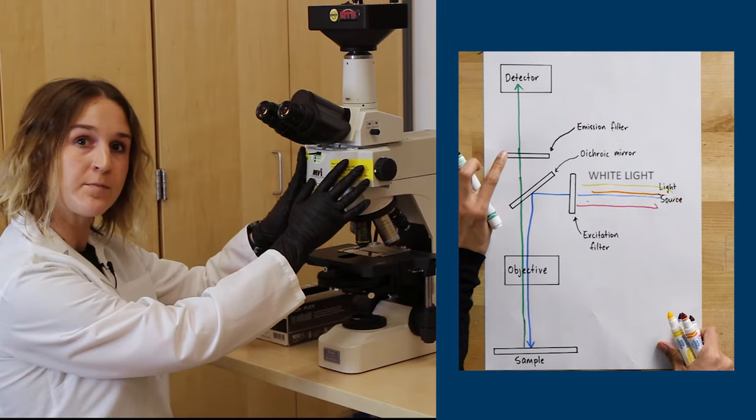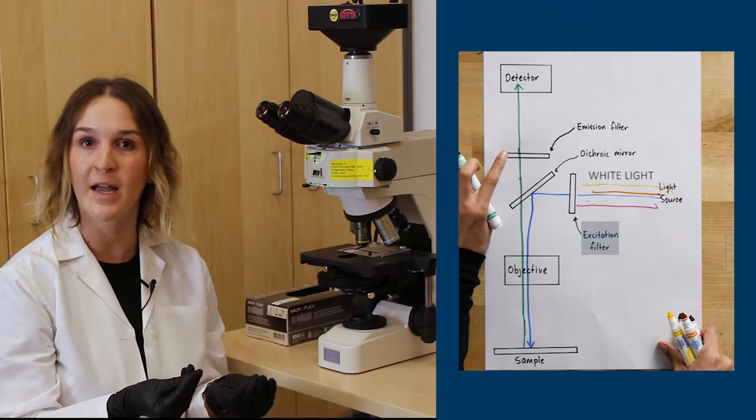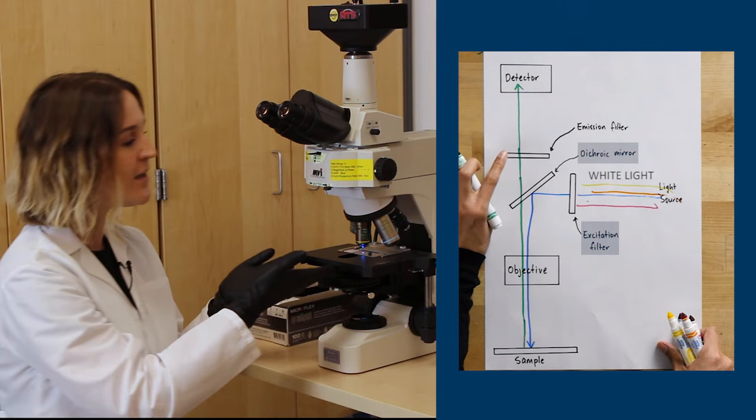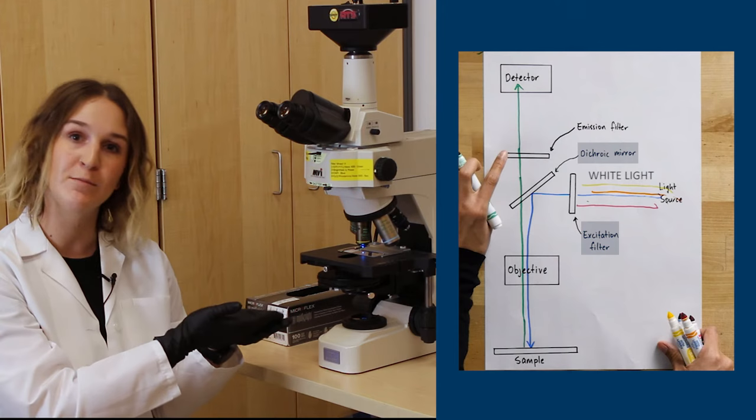And so in order to separate these two light paths we use a filter cube. And the filter cubes are housed here and they have an excitation filter that picks a particular color of light to excite our fluorescent molecule. In this case if we're using GFP we'll use a blue light and that blue light will then bounce off a dichroic mirror. And if I open a shutter here we'll see that it's made it to our sample.